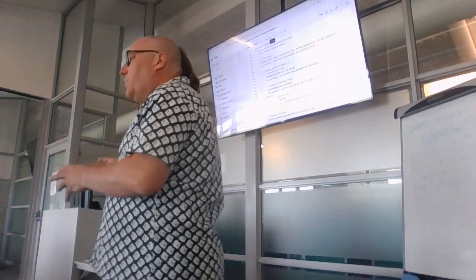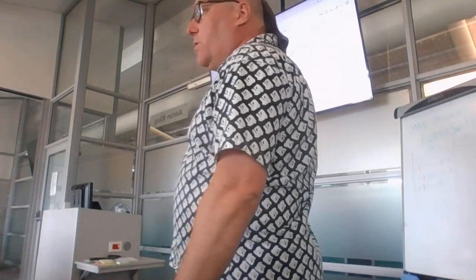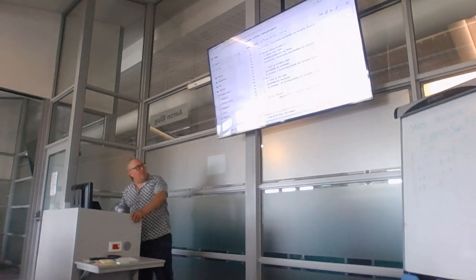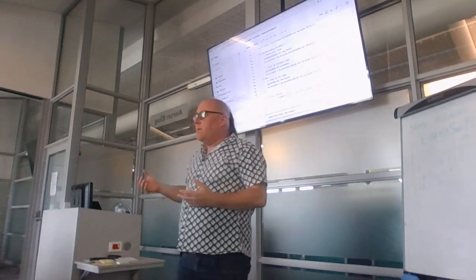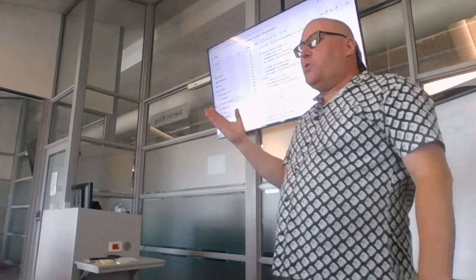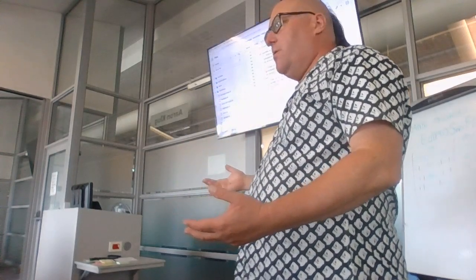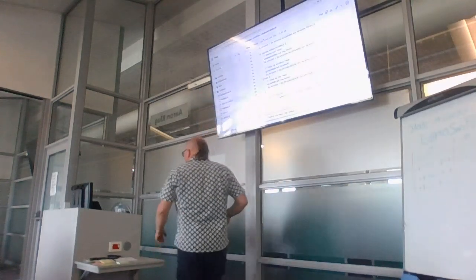So my point about this is that reading this thing, even if we don't understand exactly what it's doing, we can see, and then down here at the bottom, the workflow ends. Even if we don't understand exactly what it's doing, we can see that basically the clean your reads workflow is optionally, depending on whether you've enabled it, removing host reads, and then it's running some quality control.